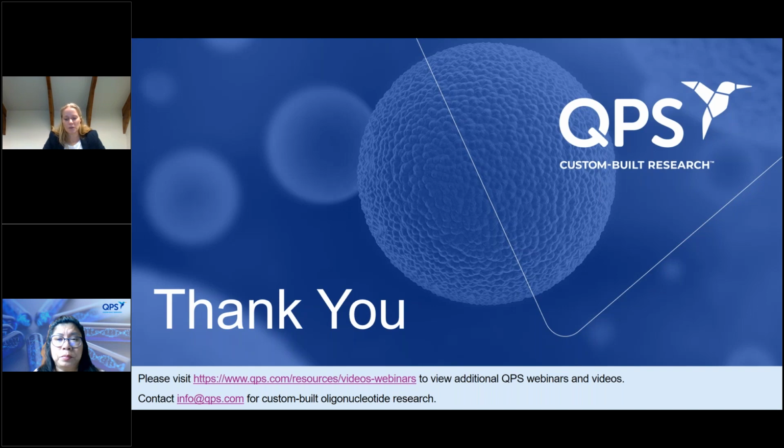They're able to implement that in their formula, I think, and they share that back with us. So upfront we know which probes are having which melting temperatures, and if we see, for example, that one probe has a really low melting temperature compared to the other two, we would rather design another one instead of using the lower melting temperature probe.